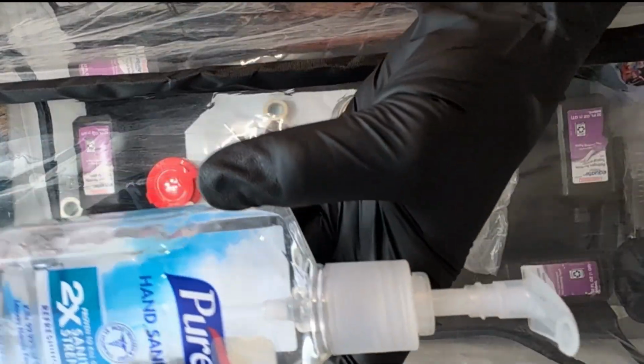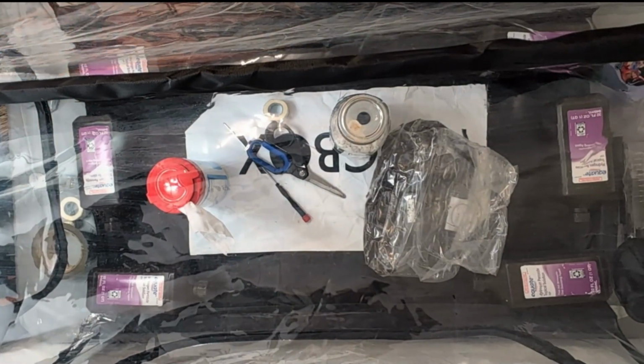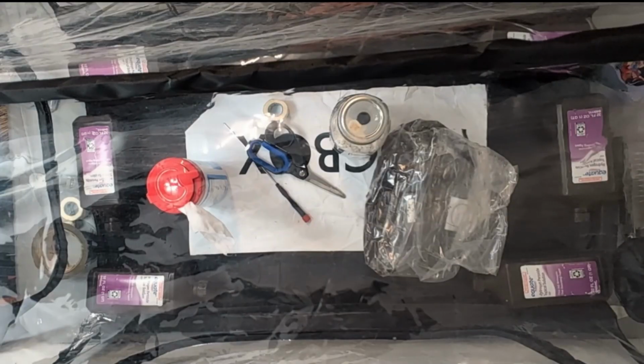I'm going to use some hand sanitizer on my gloves, and I'm also going to wipe it up my forearms, up my arm like this. From what I read, you want to keep a short sleeve shirt on, or at least pull your sleeves up, because all kinds of little microscopic beings can stick to the fabric, whereas your hair on your arms can as well. But if you're applying alcohol to the area, it should take care of all of that.